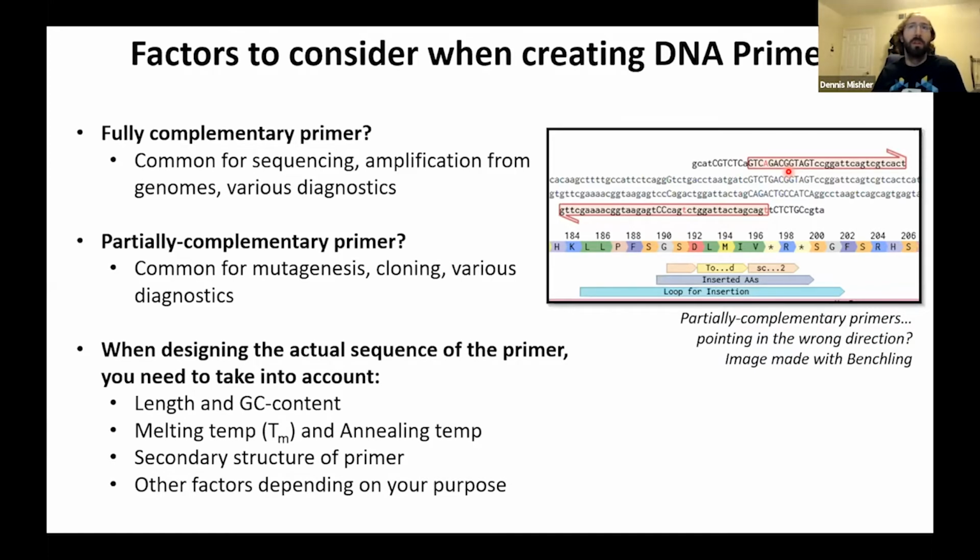do cloning with it. The other thing I want to point out about the primer is notice the arrows over here and over here. So these primers are actually going opposite directions. So this tells me these are not meant for a single PCR reaction. This primer here, the reverse one, is going to be going this way, and we'll need another primer over here to make a PCR product, while the other primer, this forward one, is going to be going past the screen, and we'll need another reverse primer way over past the screen.